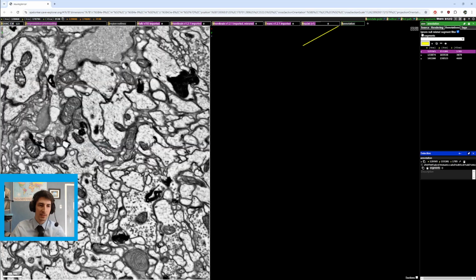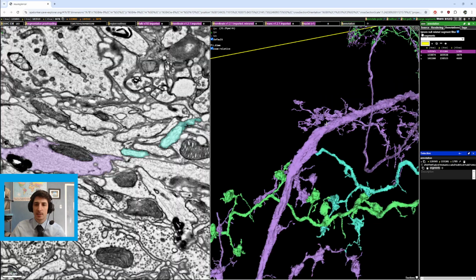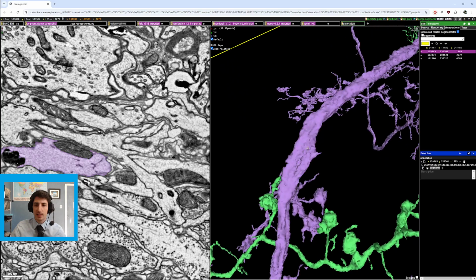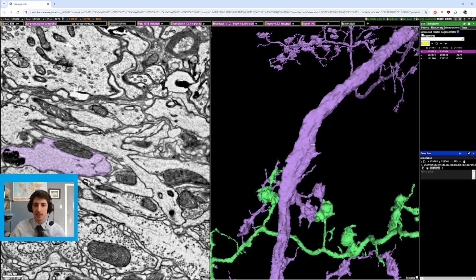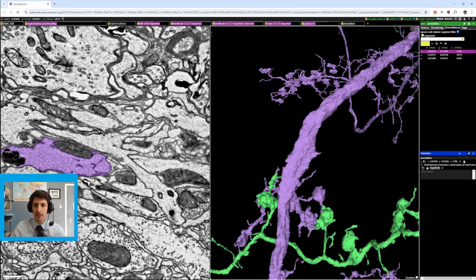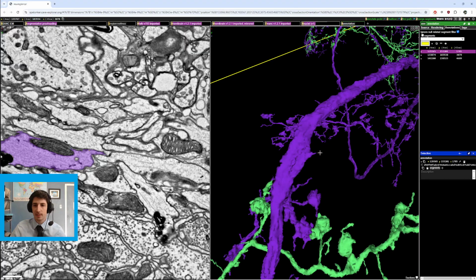As you can see, it's just a little area where it's disappearing. If we get rid of that again, you can see it kind of telegraphs that it's coming to a branch by sort of curving up like this. And on this side, if there were no branch there, it would probably just go like that and kind of connect.